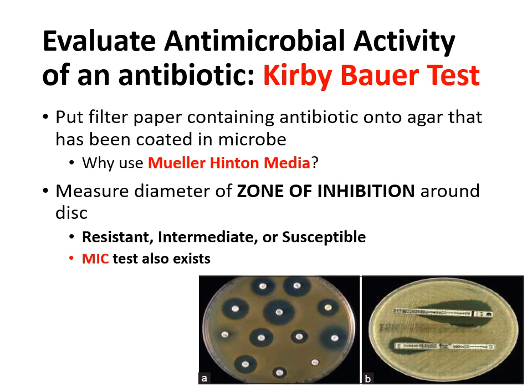Now when you perform this test, what you then would do is measure the diameter of each of the zones of inhibition. And depending on whether you see a big or small diameter, you would then determine whether or not the bacteria is resistant, intermediate, or susceptible to that antibiotic. And so what you should do is above the word resistant, write down no zone of inhibition. Because remember, if that bacteria resists getting killed, you will not see a zone.